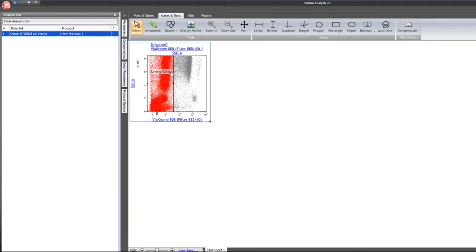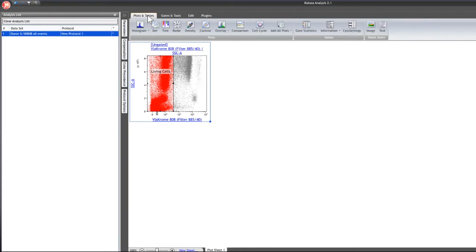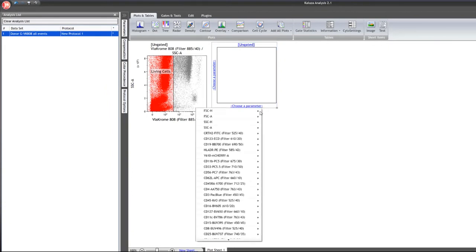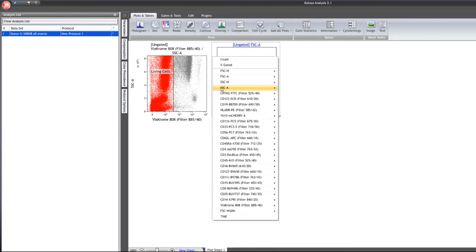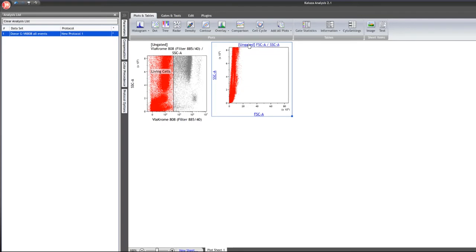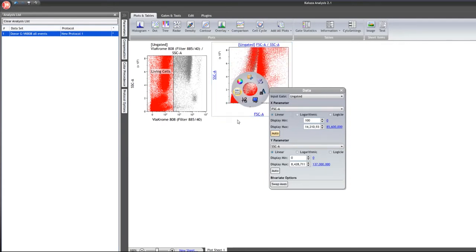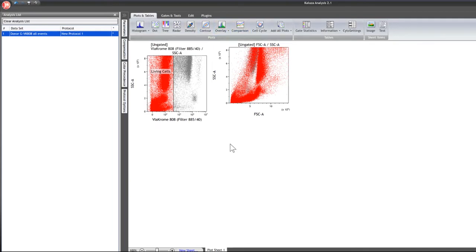To create a plot based only on living cells, go back to plots and tables and select another dot plot. I'm going to focus on forward scatter and side scatter — linear forward scatter and linear side scatter. To scale the forward scatter parameter, right-click, go to the data section, and click auto for the forward scatter parameter. You can see it fits the data into the scaling nicely.